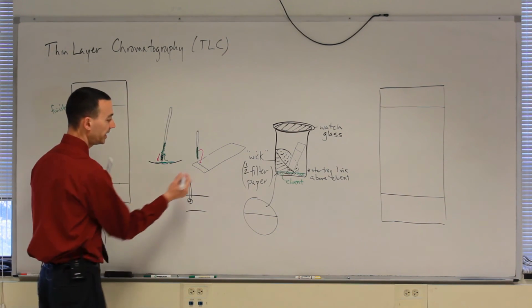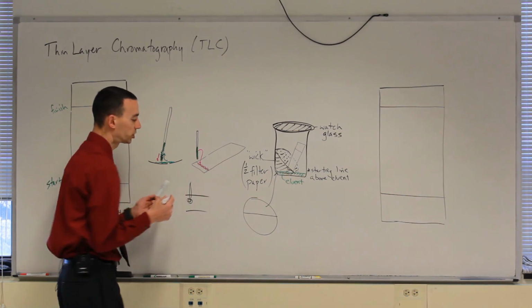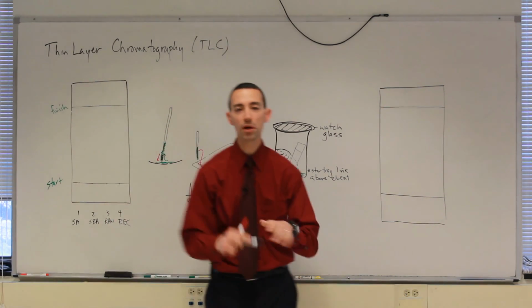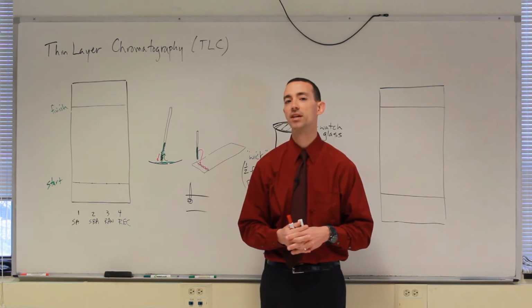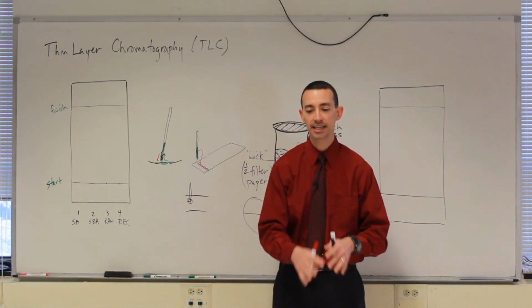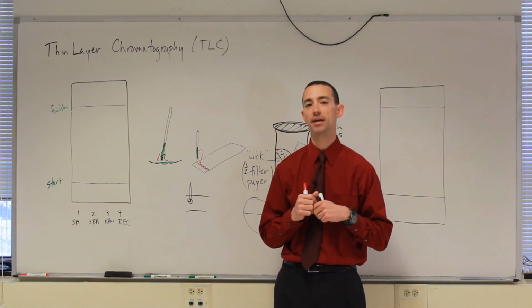Because what you're going to need is 4 dots side by side that do not overlap with each other. Okay? So instead of just thinking about one person at the beach, now imagine you're there with 3 or 4 friends. But we don't want you hanging on to each other. We want to see who is going to be the best at digging themselves into the sand and resisting the wave as it comes in.